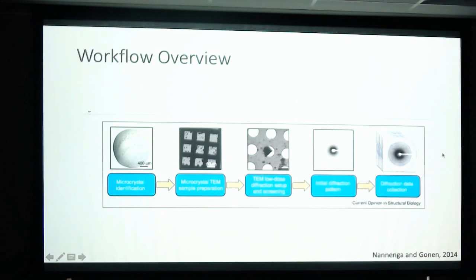Basically, the workflow overview of collecting microED is you set up crystals. Fortunately, the setting up isn't so bad, because if you're doing microED, it's like you have a failed crystallography experiment. You haven't seen any crystals. You've set up all these conditions, but you haven't been able to see any crystals. Maybe you just see this dust.